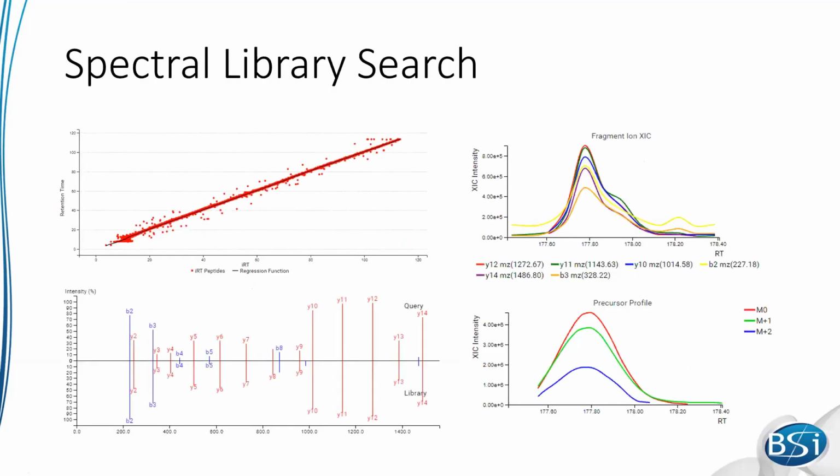So then what you generally do is take a DIA data set and search that against your spectral library. Generally speaking, DIA spectra can be quite complex, which means that just trying to match up the fragment ions to your library spectrum can be quite difficult and not going to give you an accurate result in some cases. So you need to rely on some extra information.